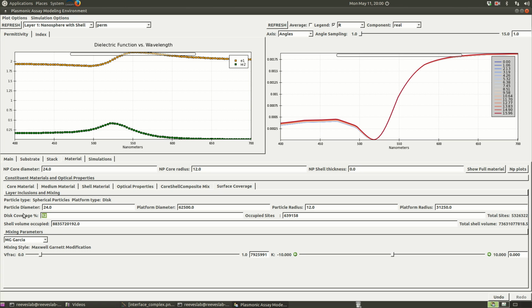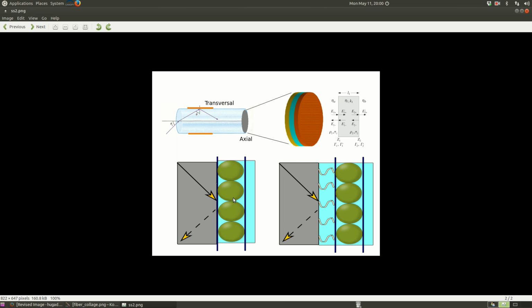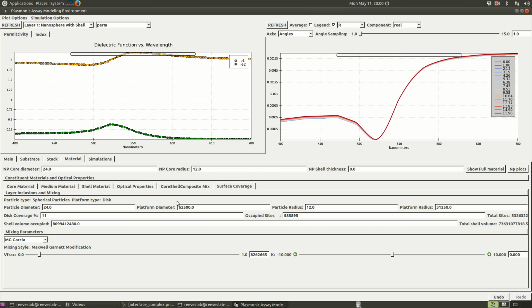It turns out that there is a characteristic inflection in the reflectance from the optical fiber. At low coverages, the end face mostly absorbs light. This means that as light is propagating down the fiber, it's absorbed by the nanoparticles, and so less of it is reflected. However, when the nanoparticles fill up the film density, they act more as a reflective mirror, and in that case, the reflectance actually increases. And the turnaround point at when the signal goes from mostly absorbing to mostly scattering for particles of this size is at about 11 or 12%.